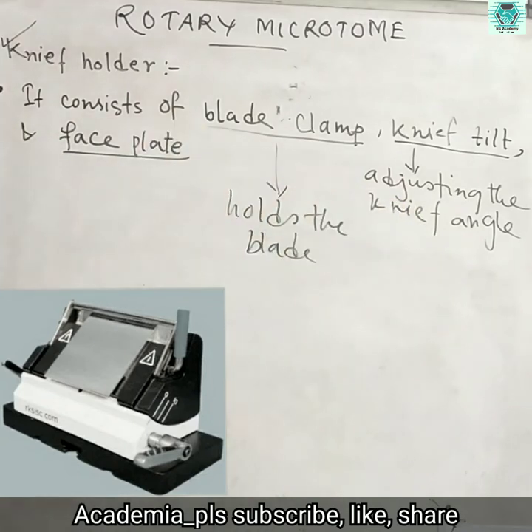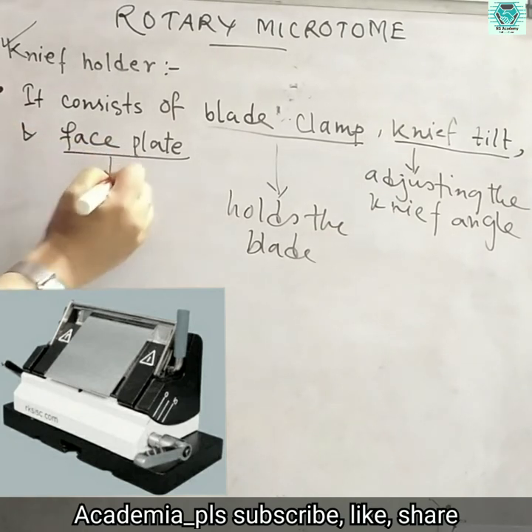And the face plate guides the ribbons away from the blade and towards the operator. So what is the function of the face plate?